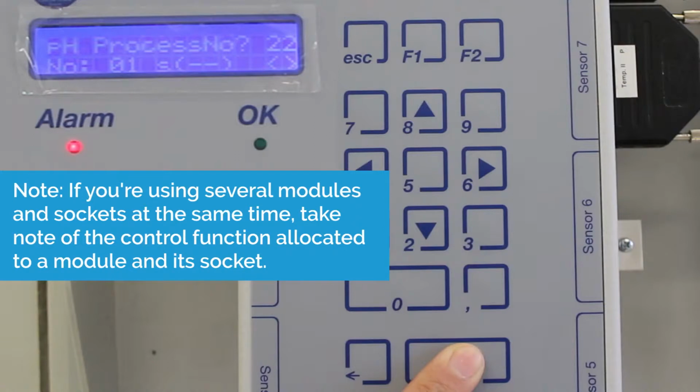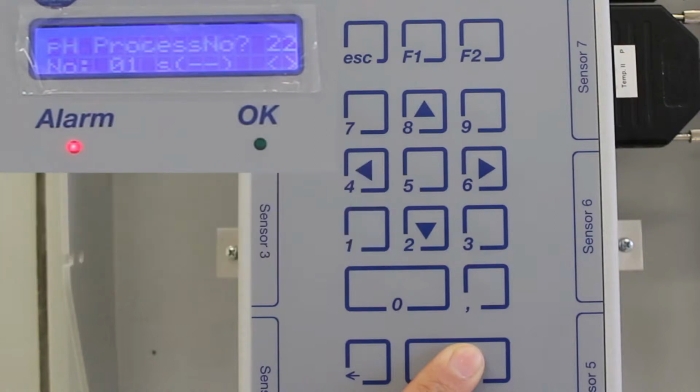Once a module is selected, you can allocate several control functions for one module. The number of processes is indicated on the lower line, and the socket for controlling is indicated inside the parentheses. If there are 2 dashed lines inside the parentheses, the control process is not yet allocated to any socket.